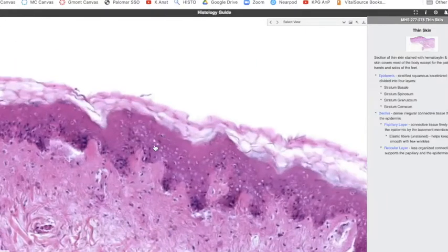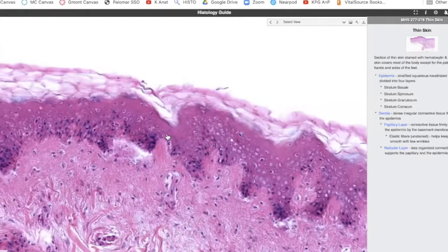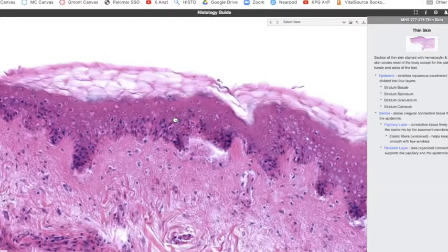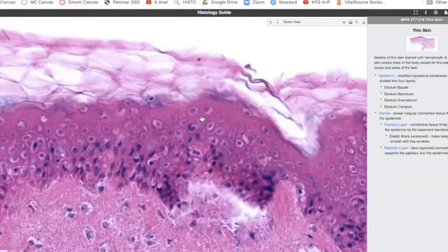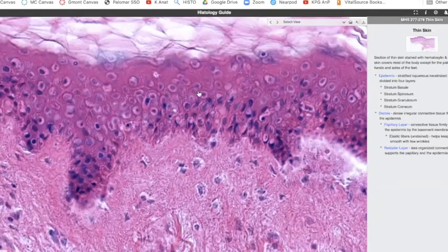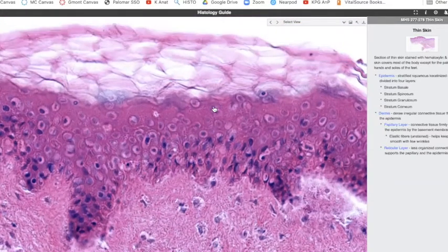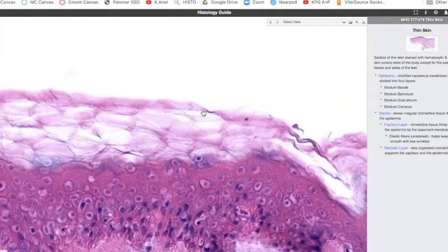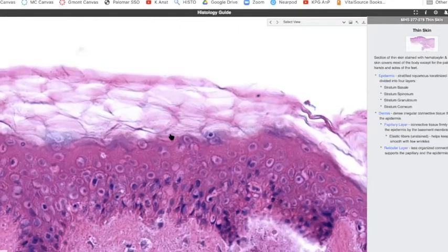And it's also in your skin exercise, this is your thin skin, right? So all these cells, which are relatively close together, even if you can't see the whole cell, they're all kind of bound together. And because it's a dry stratified squamous, you got this dead cell layer on top there that due to preparation has kind of flaked off.